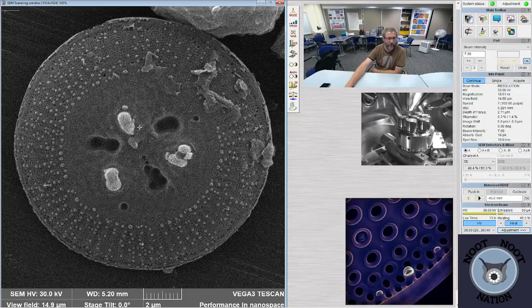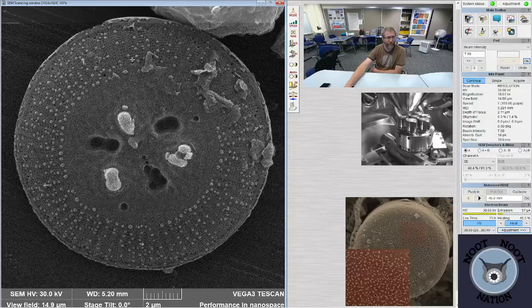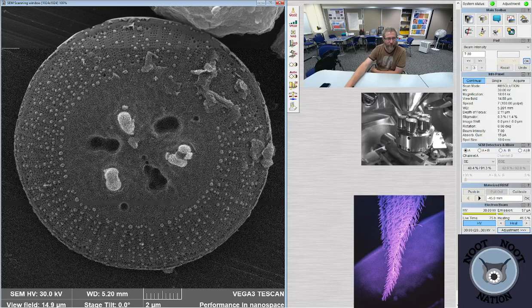There may be as many as 6 or 7 or 8 in some of them. And then this is pretty characteristic of the striae. Usually they're multi-seriate. So this is in rows of 3, basically, through most of it. These little dots that are all over the surface are called granules.